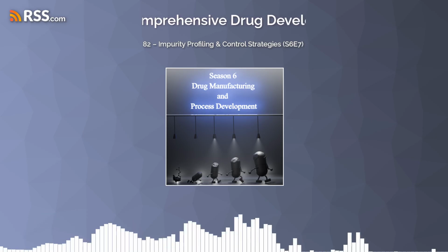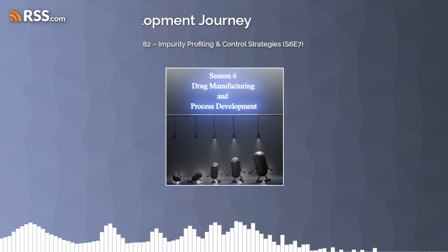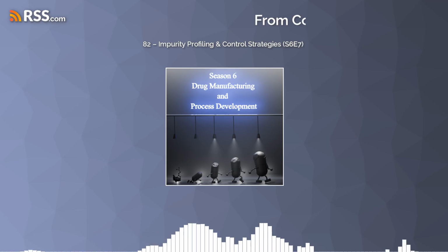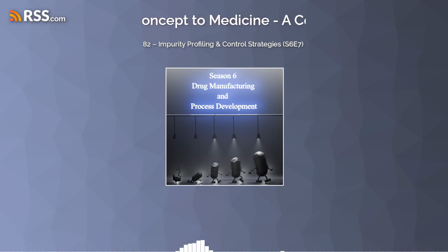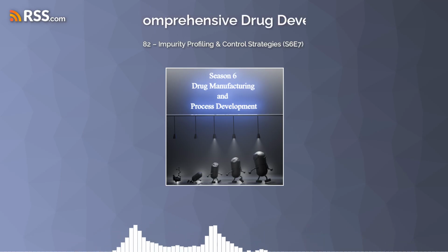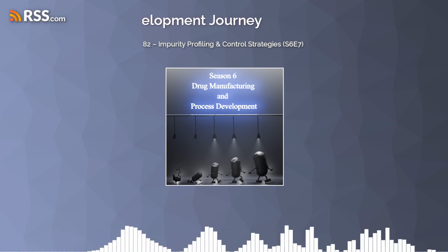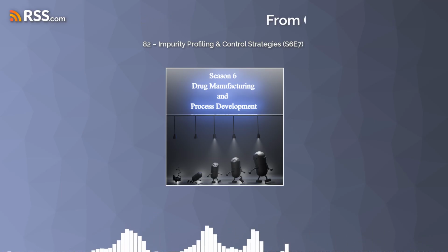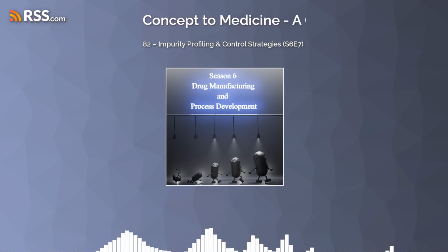Well said. So as we wrap things up, what are the big takeaways, the things you really want people to walk away with from this deep dive into the world of impurity profiling and control? I think the main thing is, I hope they have a better appreciation for the complexity, how much goes into making sure our meds are pure. It's not just one thing, it's layers and layers. You've got these incredible analytical tools to find even the tiniest amounts of unwanted stuff. And then you've got this whole science of designing and controlling the manufacturing process to prevent those impurities in the first place or get rid of them efficiently.